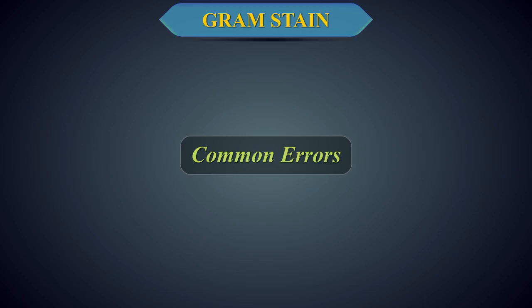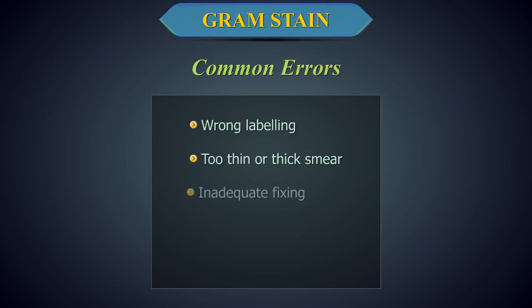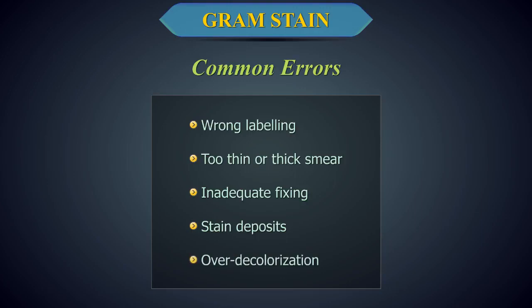Common errors while performing a Gram stain: wrong labeling, too thin or thick smear, inadequate fixing, stain deposits, over decolorization.